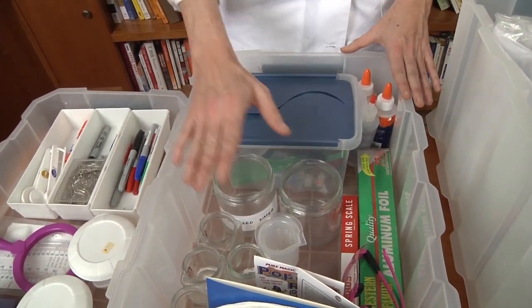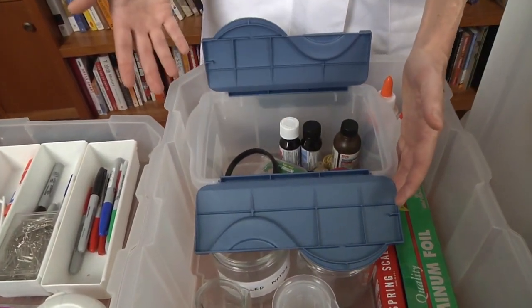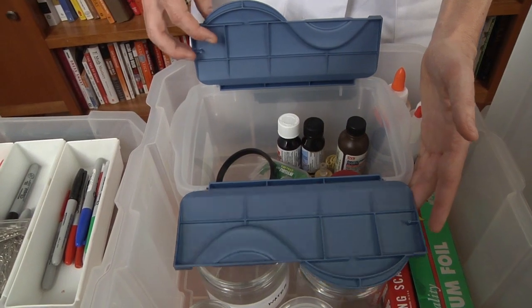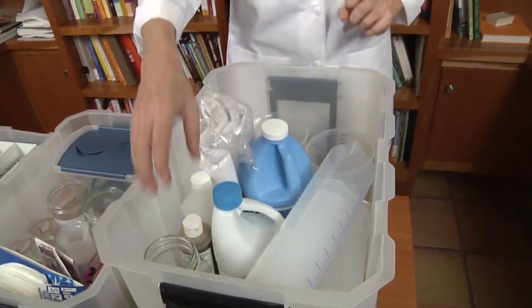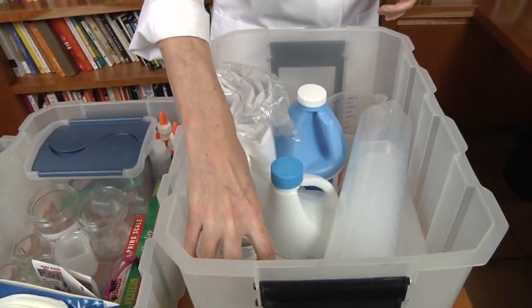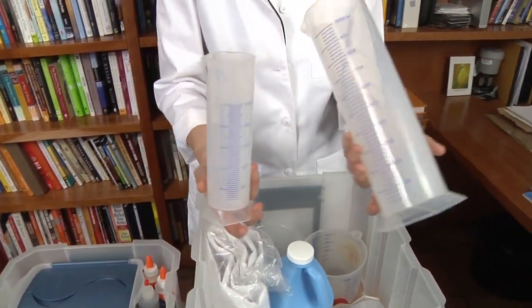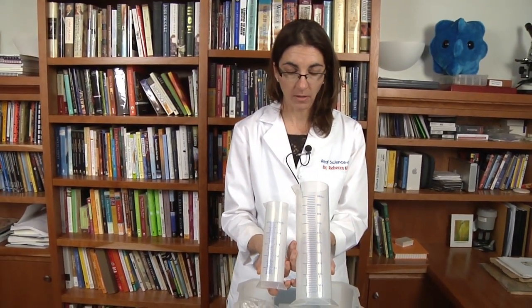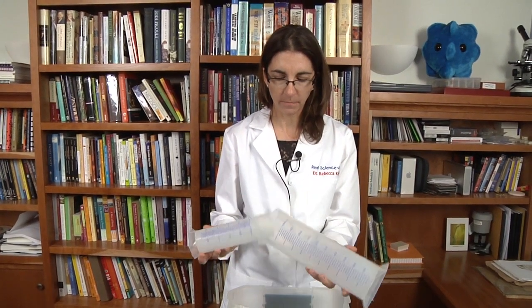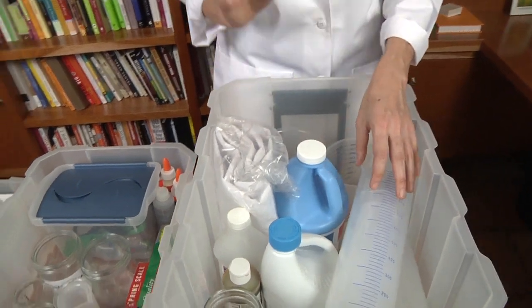I also have in this bin my coffee filters, and a smaller section here for a number of smaller items. For the larger section, you can put some of your larger items — I have some larger jars that I use for some of the experiments. I also bought these graduated cylinders. You don't have to use these, but if you want to measure larger volumes, students in chemistry labs use graduated cylinders. You can purchase those if you want, but you don't have to.